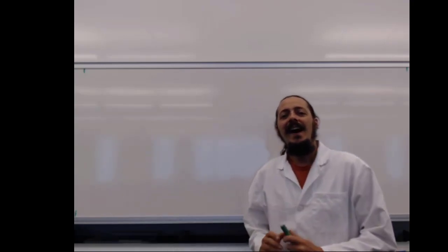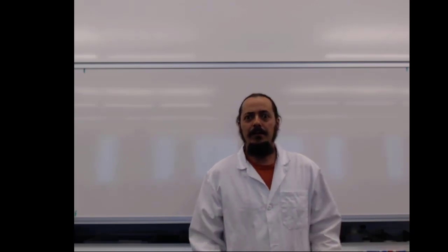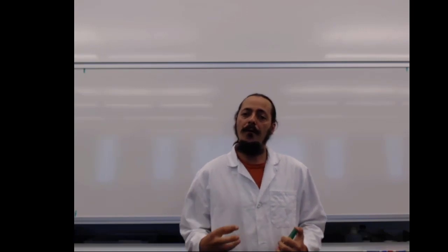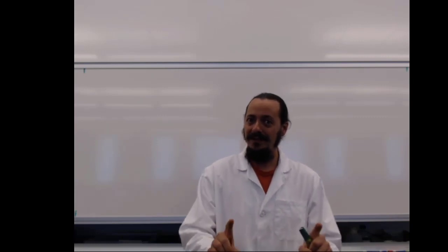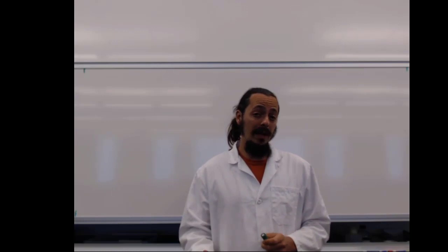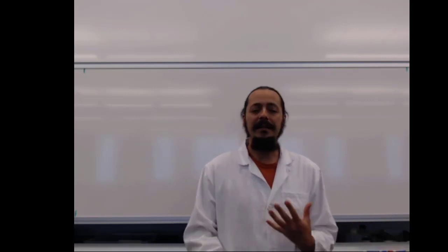Hey everybody. Today we're going to do a couple chemical reactions. Finally, right? We're in a chemistry class. We've been learning all about chemical compounds. We're finally at the point where we can mix chemicals together and see what kind of things happen. But before we do, we want to have some thought about what's going to happen before we just go willy-nilly mixing things together. So we're going to predict some chemical reactions using a couple tricks.